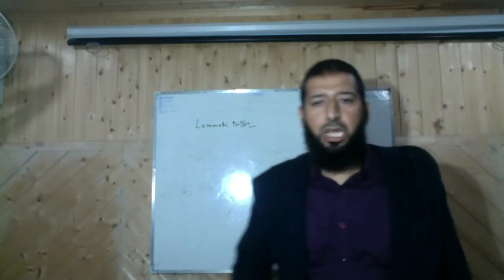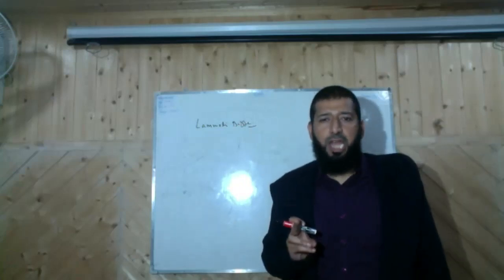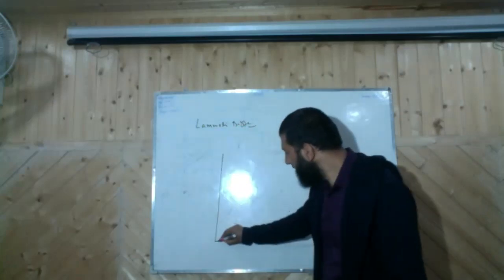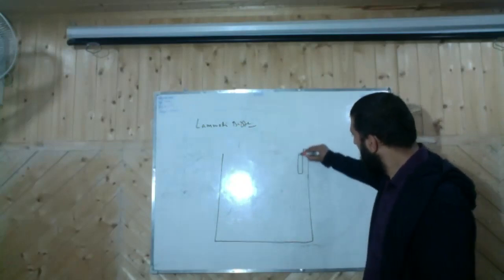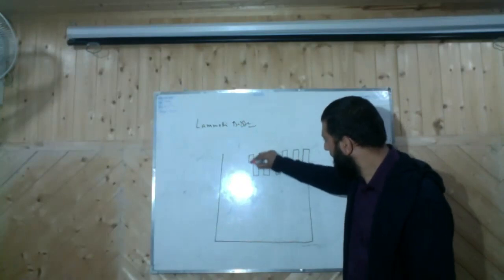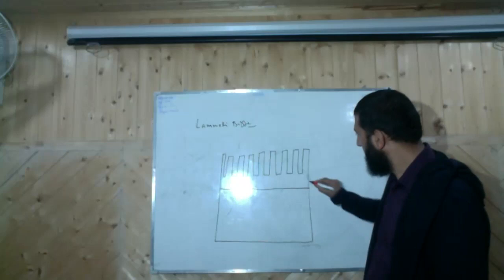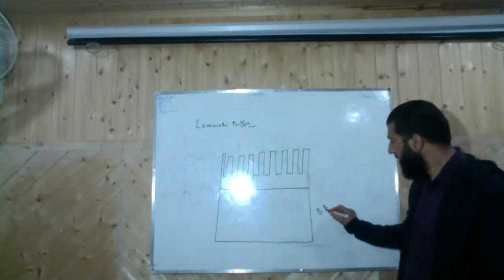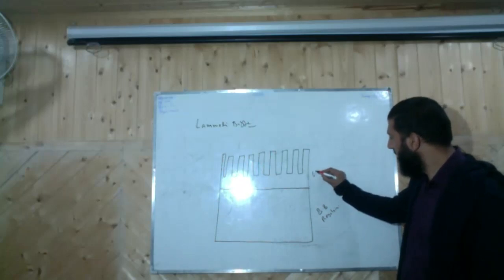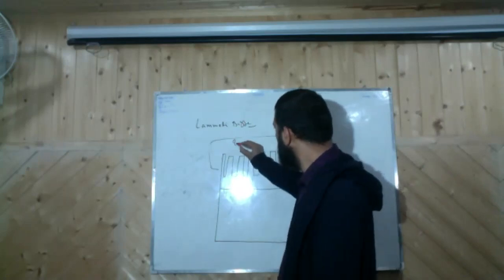Now the question arises, why we use two gels, one stacking and one resolving in this, while in agarose gel electrophoresis we use only one gel. The pH of this is 8.8. This is your resolving gel. And this is 6.8. This is your stacking gel. And then you have the buffer tank in which you put this. And the pH of this is 8.3. This is just glycine.